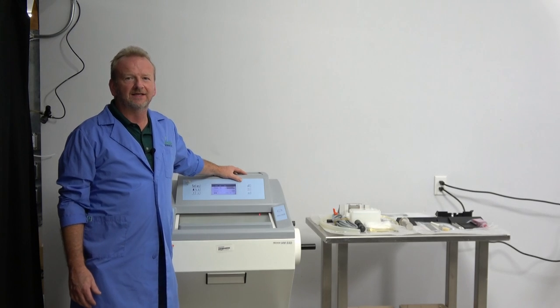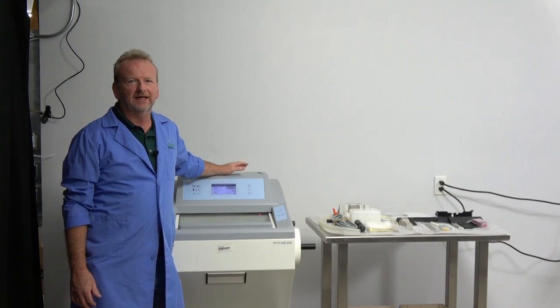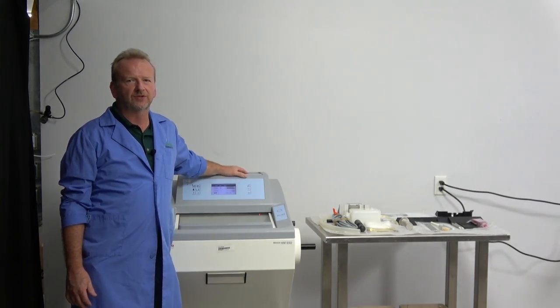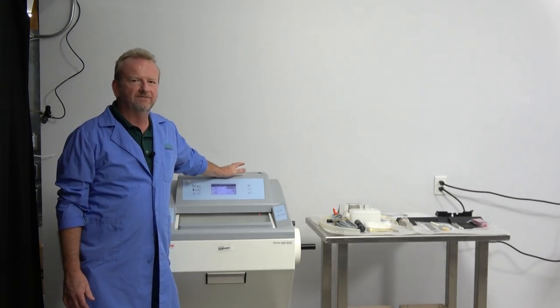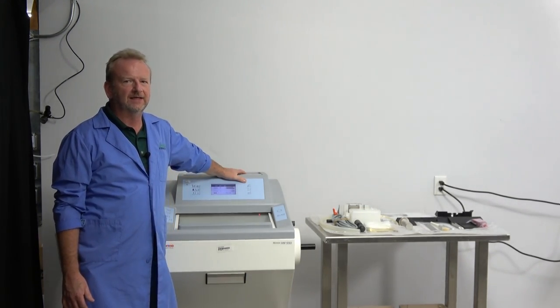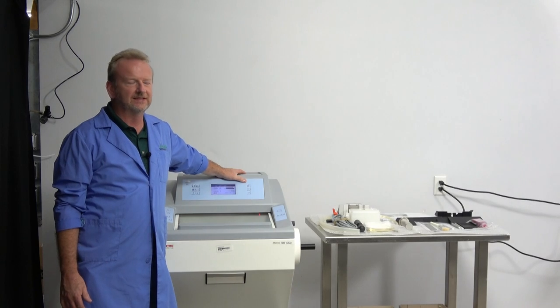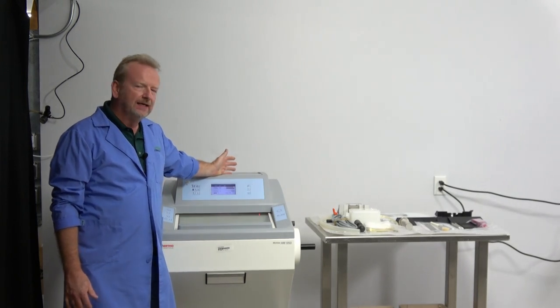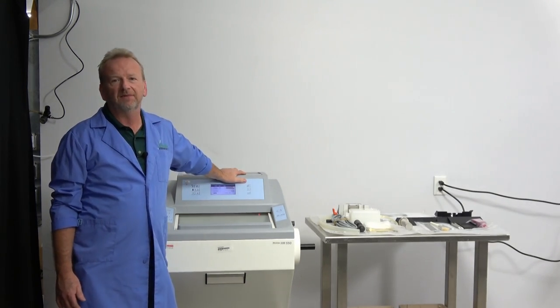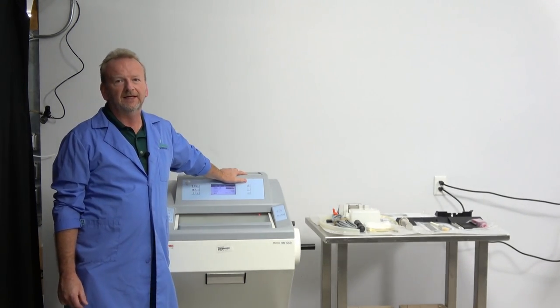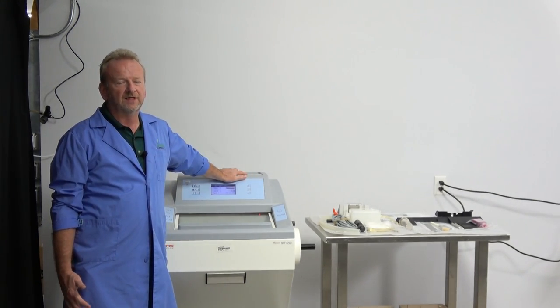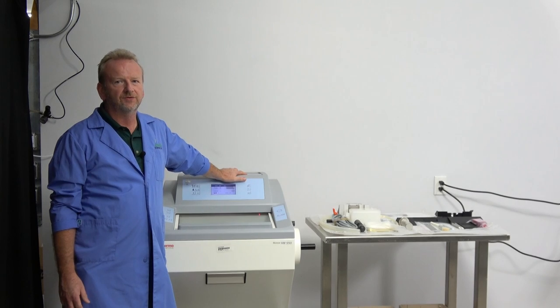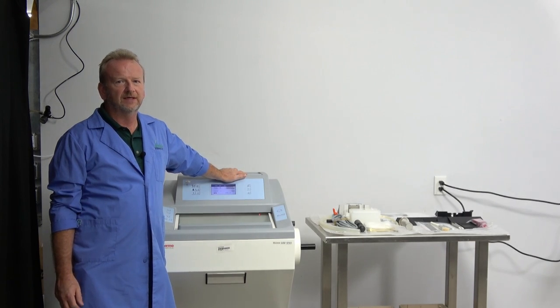Hi, I'm Rich with New Life Scientific and I just wanted to shoot a quick video of this HM-550. The reason is because it's actually never been used, and we've done a lot of used ones that have come in.